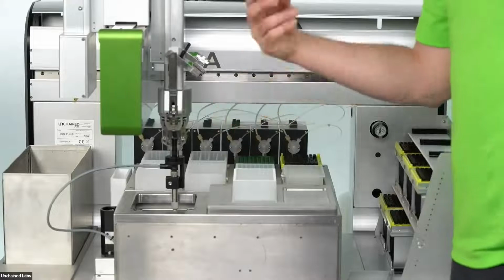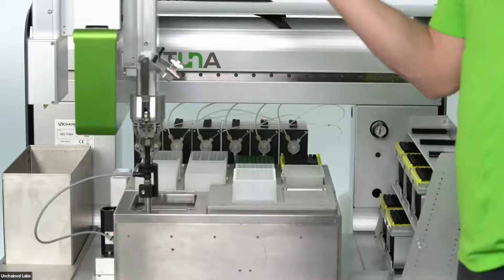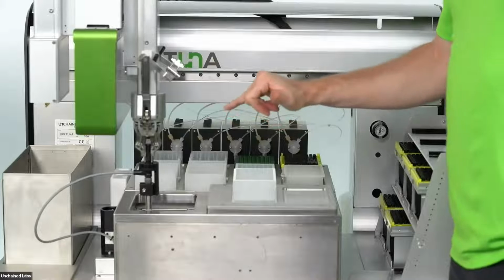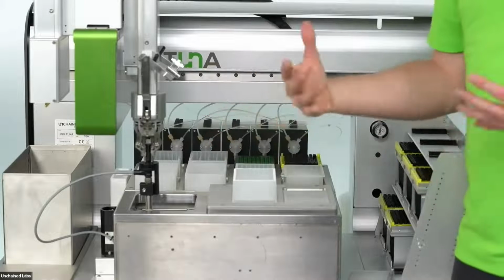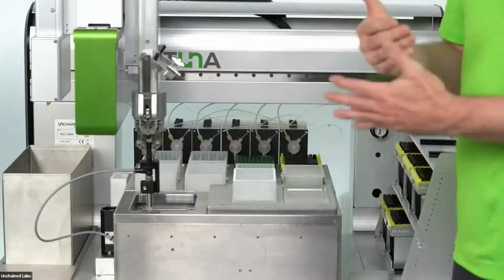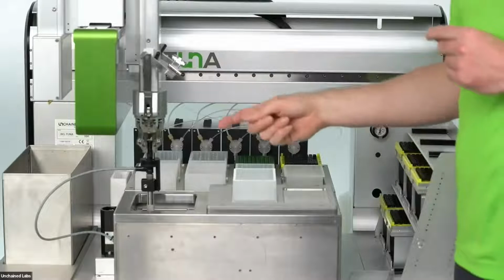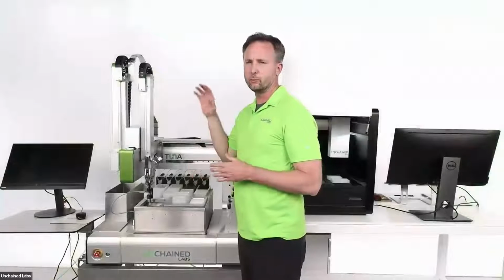And then it will go through using that ultrasonic volume sensor, which has about up to a 10% accuracy specification. And it will measure that sample volume of each one. Again, how is that information used by Big Tuna? Well, essentially, it adapts the positive pressure, the amount of time that positive pressure is applied in every single buffer exchange cycle. And the reason for that is your sample integrity is prioritized.